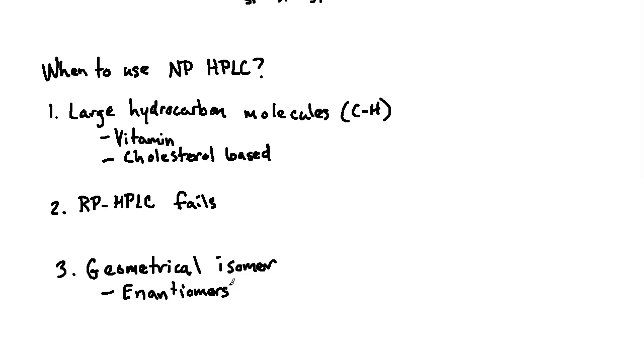You have to be able to separate them out because they could have different binding receptors in the body, but it's very difficult if they have the same exact chemical functional groups and sort of chemical identity to be able to take them and separate them out and say, oh, well, I'll just solubilize this set of enantiomers in a water and ethyl acetate extraction, because they're both going to go into the same phase. They have the same general chemical properties when you're taking a look at them. So having the ability to separate this out is very, very important.